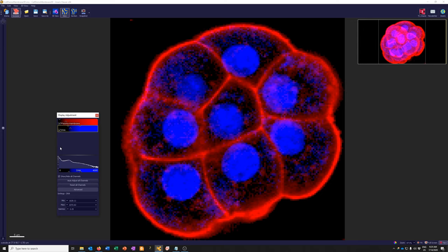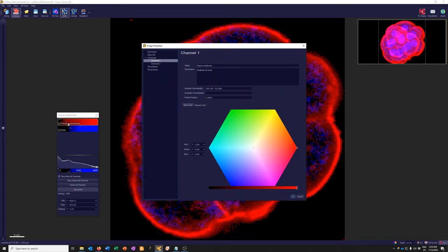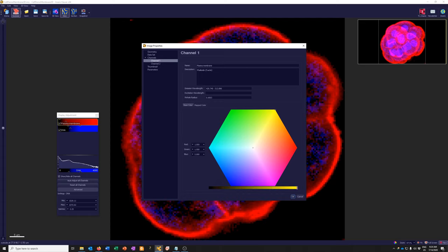Another thing you can do is change the color in which the information from a channel is displayed. If I click where it says 'plasma membrane,' I get another part of Image Properties centered on channel one, with a color wheel. This color wheel shows the current color — currently 100% red, 0% green and blue. You could easily change it to green, cyan, blue, magenta, yellow, or put it in the middle for a grayscale display. Here I've put it on grayscale, and we can see it clearly now.